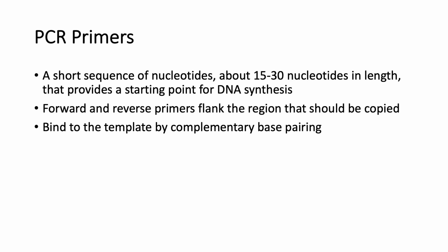The next component is the PCR primer. Any region of any DNA molecule can actually be chosen to be amplified. The only requirement is that the sequences at the ends of that region are known. The oligonucleotides, which act as primers for the DNA synthesis reactions, define the amplified region. PCR primers are synthetic DNA oligonucleotides of approximately 15 to 30 bases. PCR primers are designed to bind via sequence complementarity to sequences that flank the region of interest in the template DNA.